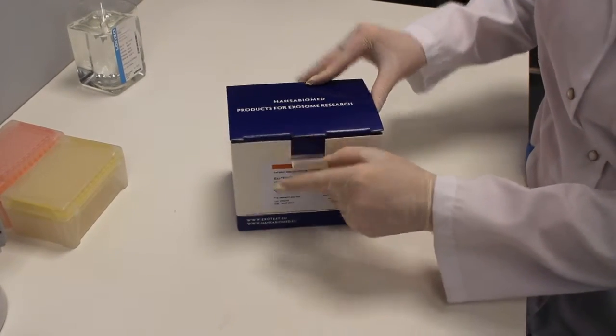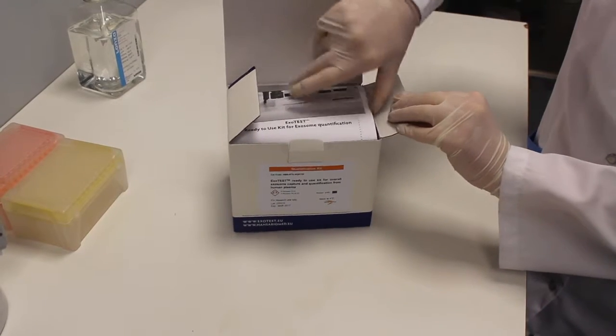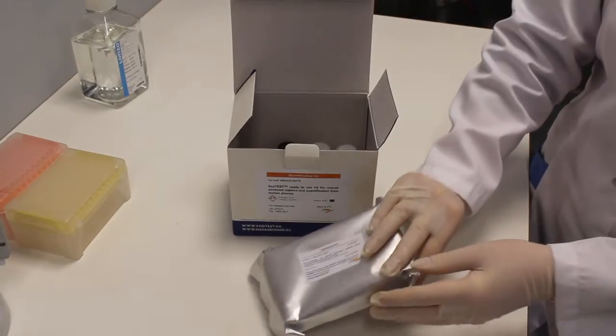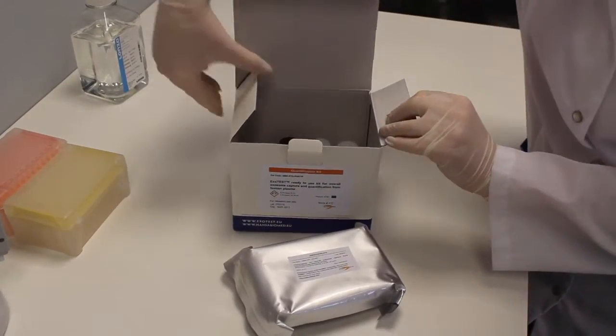ExoTest ready-to-use kit includes all necessary components for easy and reliable capture and quantification of exosomes from crude biological samples.